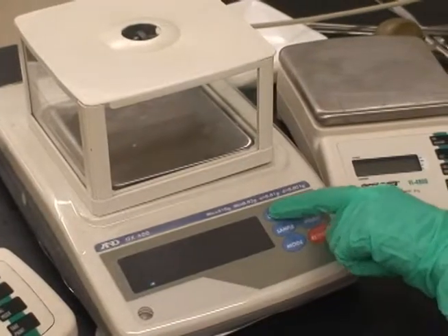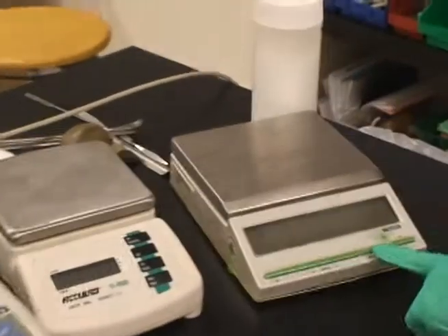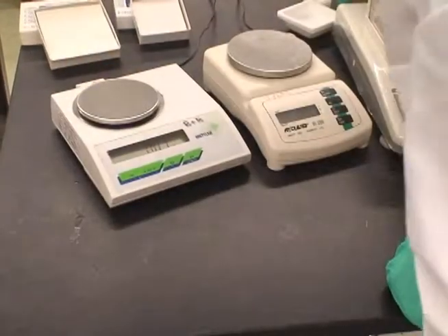While there are many different balances as shown, they all work in essentially the same way. The first thing you should do is turn the power on. Then you should place either a weighing tray or weighing paper and zero out the balance.